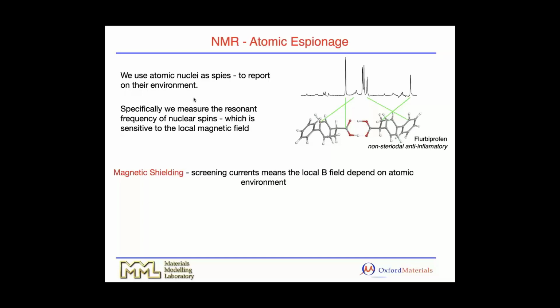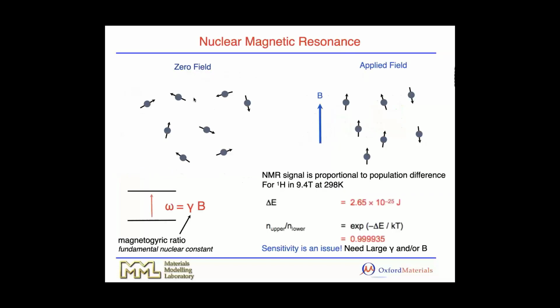What we see in an NMR experiment is related to how the electrons behave in a magnetic field, and that fundamentally comes down to quantum mechanics. Okay. So what we're going to provide in terms of a DFT code like CASTEP is a means of decoding what is going on inside our NMR experiment. How do those frequencies that we see relate to the underlying chemical atomistic structure?